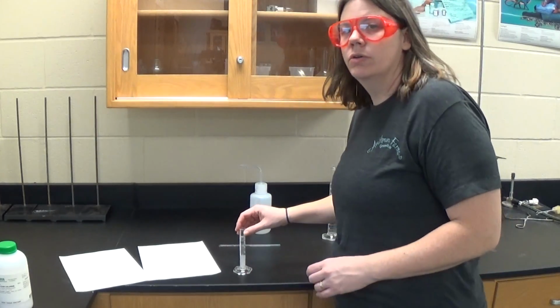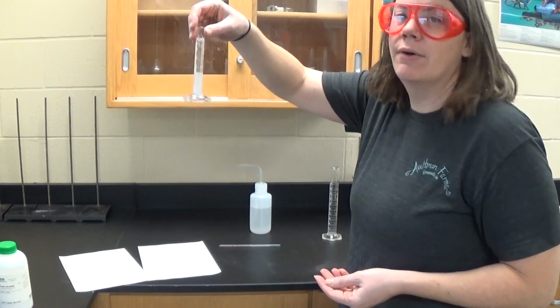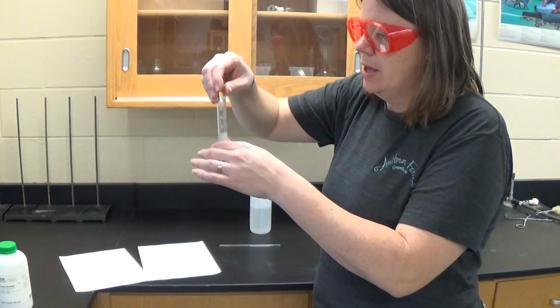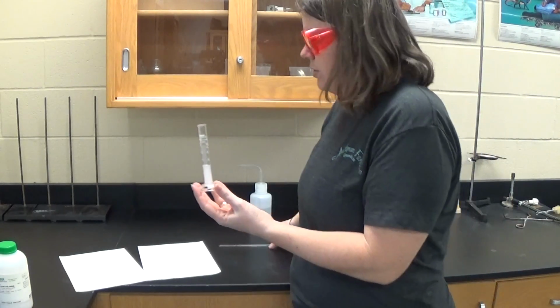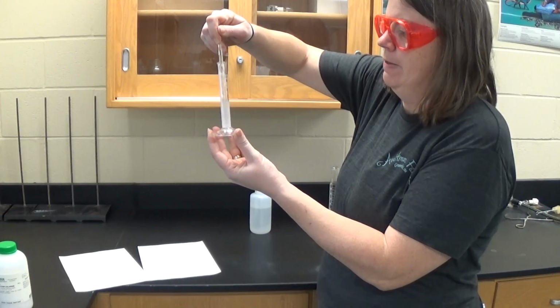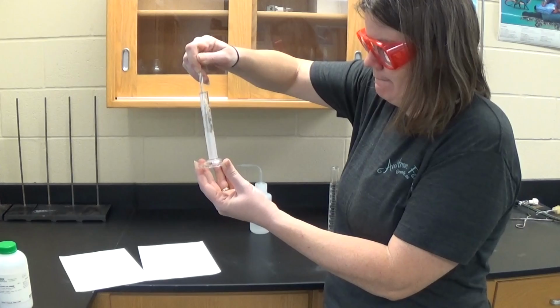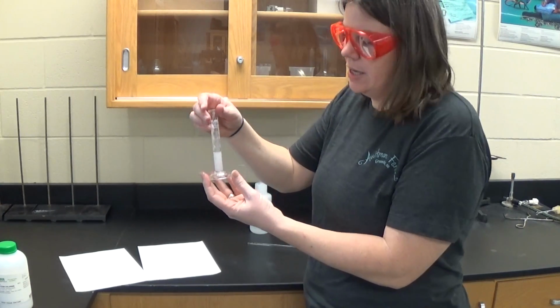I'm supposed to make all observations I can. I don't know if you can see that, but that is very cloudy. The calcium chloride has dissolved, or it is dissolving. And when I touch it, it is warm. It is warmer than the water was itself. So if I go ahead and I stir some more, yes, and it's getting warmer.